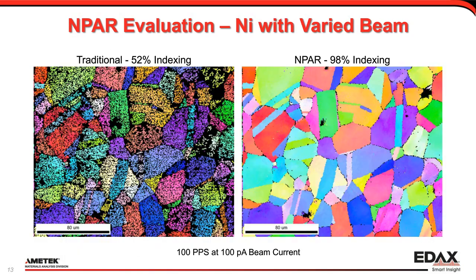Now let's go on to some more real-world examples. In this particular case, 100 patterns per second at 100 picoamps of beam current — pretty conservative by all metrics. Traditional indexing really didn't do a very good job; your eye picks out the grains but there's a lot of noise. By applying the NPAR routine, we get up to 98% indexing. Through the grains, you can see the central portions are very clean. Most of the remaining bad pixels are along boundaries, as could be expected, or due to pits or holes in the sample.